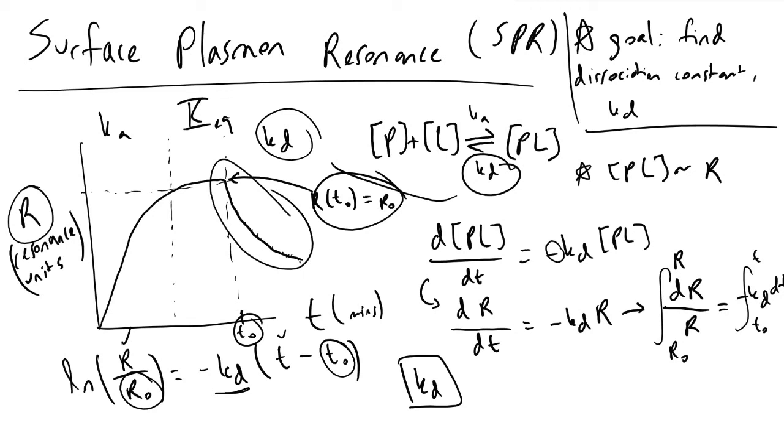And so this is very important stuff if you are interested in biotechnology or how a ligand will interact with a protein, how readily it will let go. Oftentimes when we're evaluating candidates for drugs, you want stuff that will have a high binding affinity so that it can have a long half-life inside the body, for instance, so that it can be effective and potent. But it is pretty interesting stuff to think about.